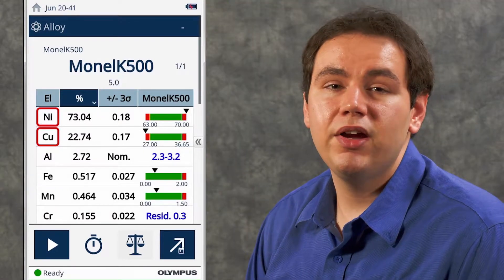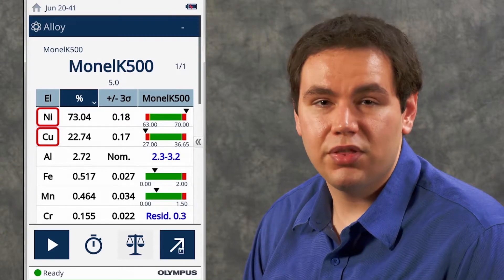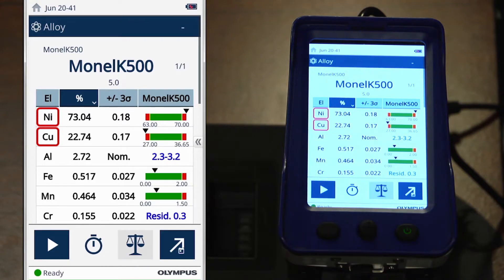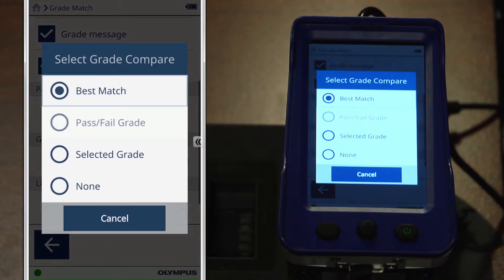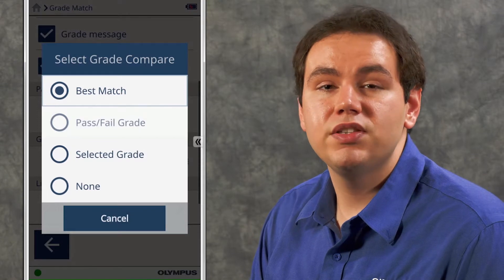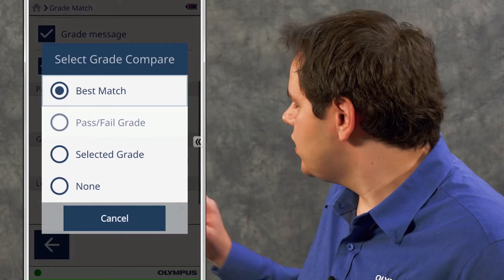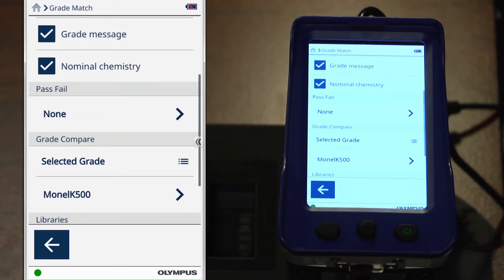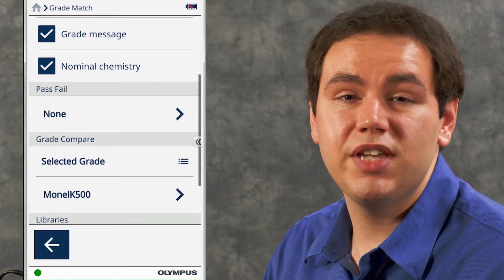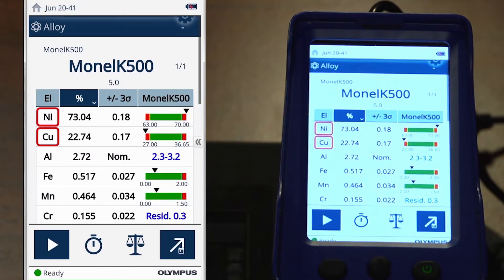In our case, since we are comparing our sample to a single alloy grade, we're able to refine this search even further. To do that, once again open the grade match icon, scroll down to grade compare, and select. Right now the Vanta is set up with best match, which compares our sample with all of the grades in the grade library and finds the best match. To further refine this, we can hit selected grade and then choose our sample, Monel K500. By doing so, the Vanta will now compare our sample to just the specifications for Monel K500.